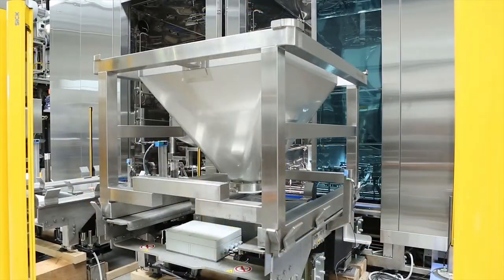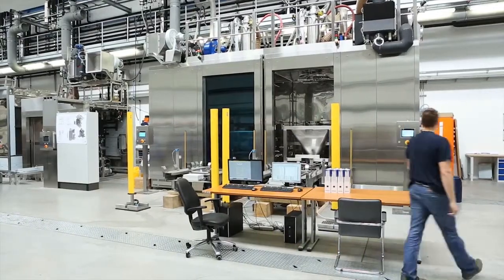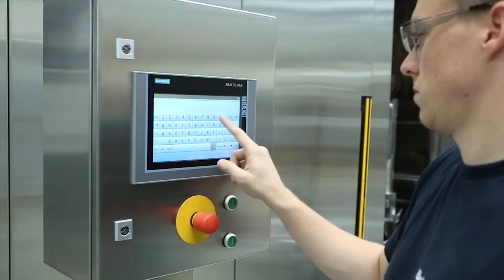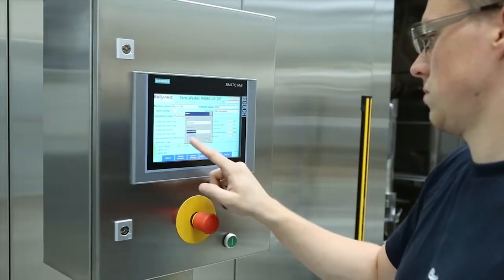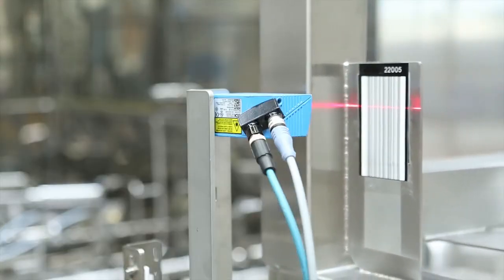When the new item to be washed is waiting on the loading table, the washing process is ready to commence. The machine can be started either manually by the operator over the HMI, or automatically by using the barcode reader.